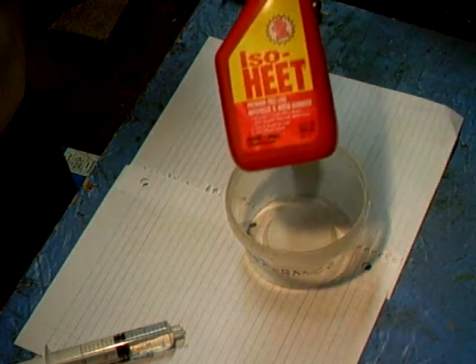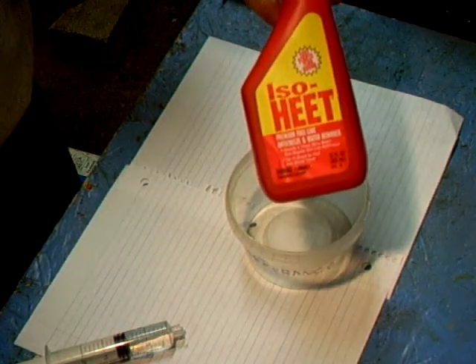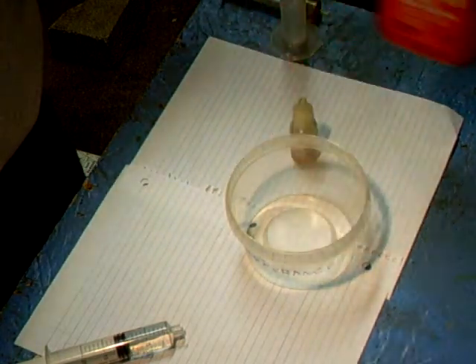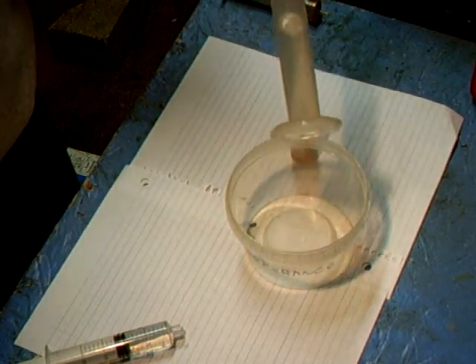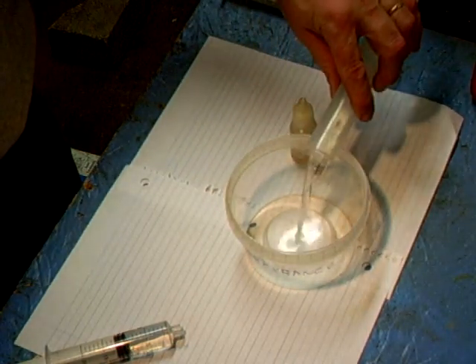Let's get started. We have the heat and isopropyl alcohol. I've already pre-measured out 20 milliliters. Dump that in the container.